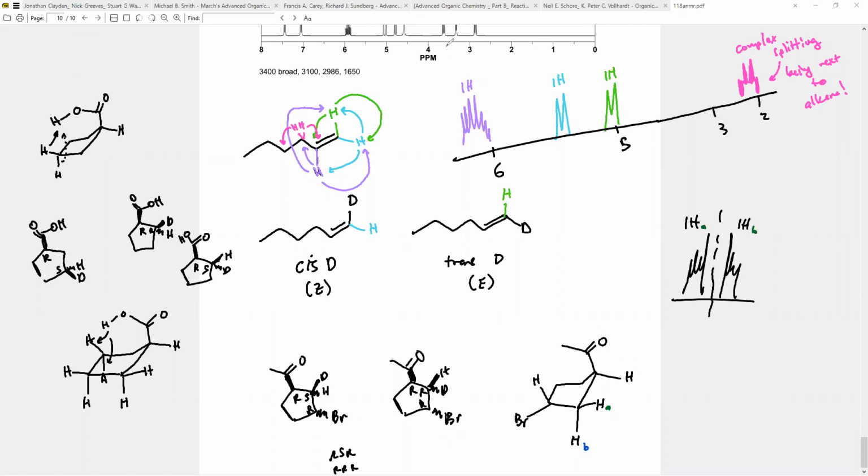so like this is the chiral center, right? Oh, actually this one's a bit difficult because there's two of these, but generally it's the hydrogen that has more hydrogen interactions, right? So it's interacting with more hydrogens, it tends to be the one that's more deshielded. That's the general rule of thumb. But not that you guys need to know that, not just quite yet.